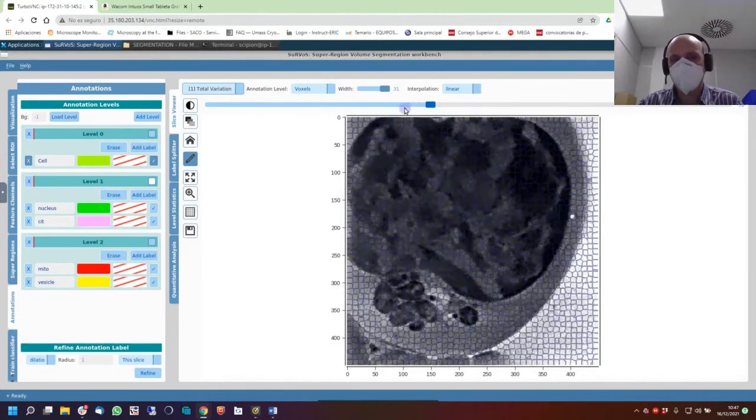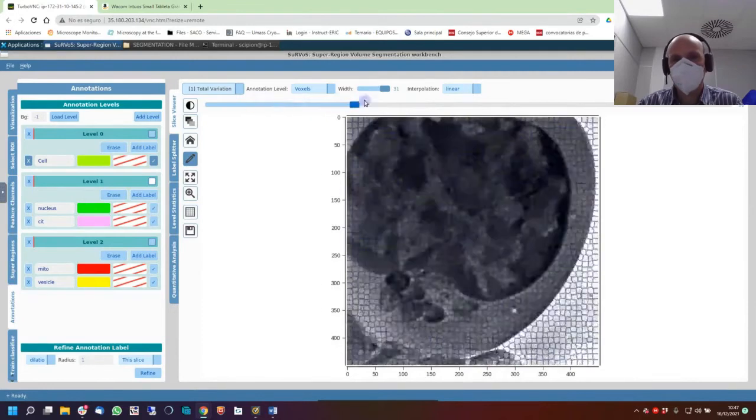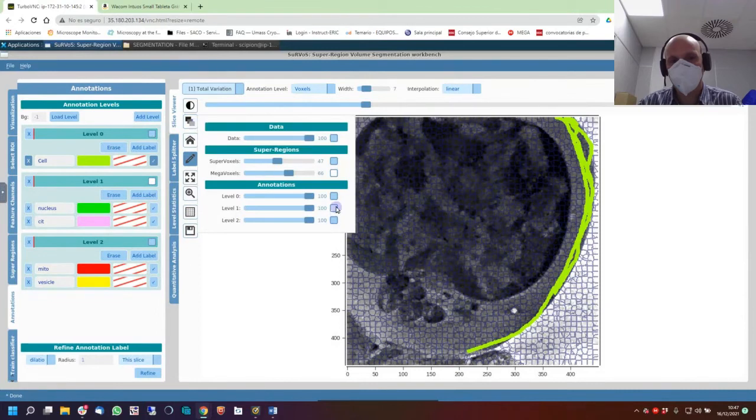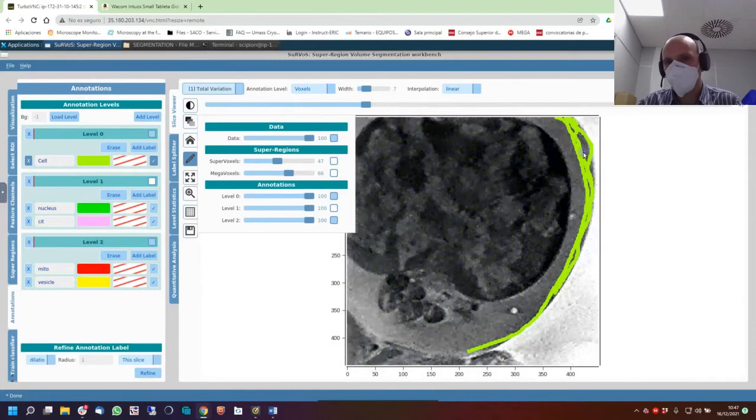How to do that? There is a way. Go for a thicker pencil. Oh, it doesn't paint. Why? You will see that if you try to do this, it's not easy. Be careful to avoid this. If you wanted to do that, it's complicated.